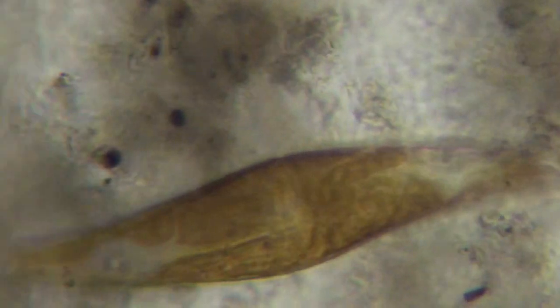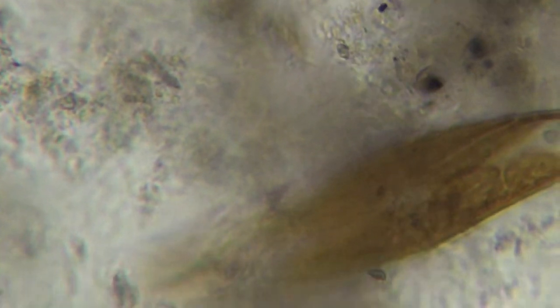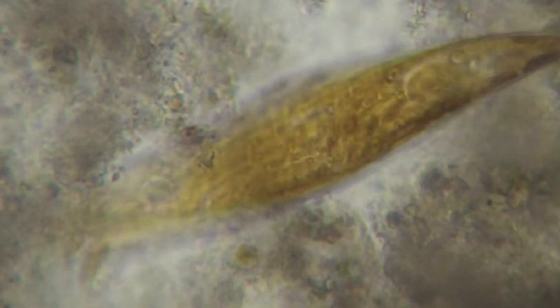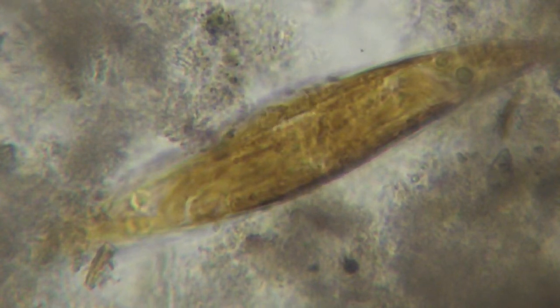Alright. Ooh, that's a huge diatom. Look at that guy. Big one. You really see the structure in this one, too. You can see the photosynthesizing regions there, and then you can see little circles in there, little spheres. Those are oil droplets. Those are its form of food storage.